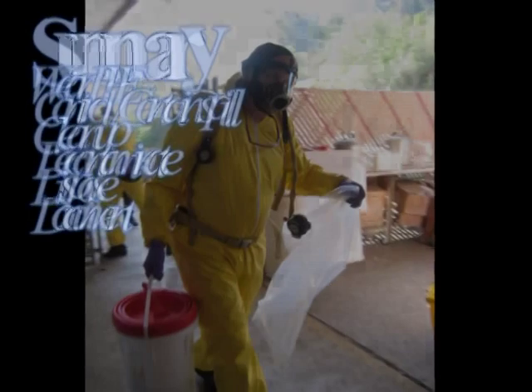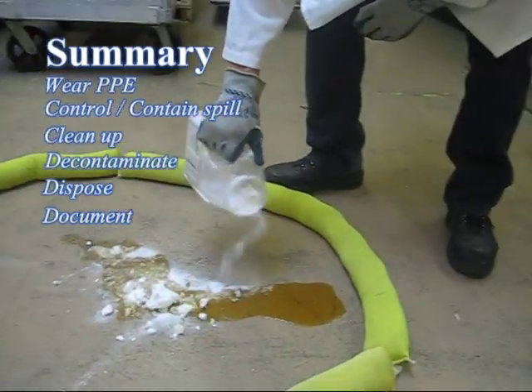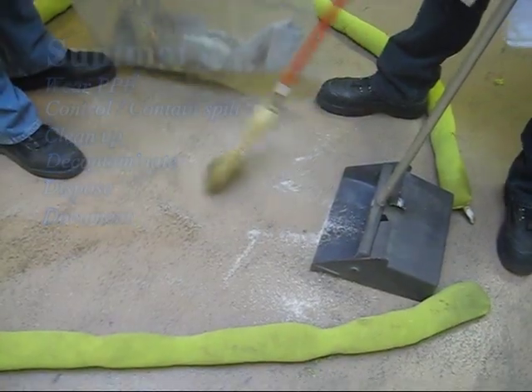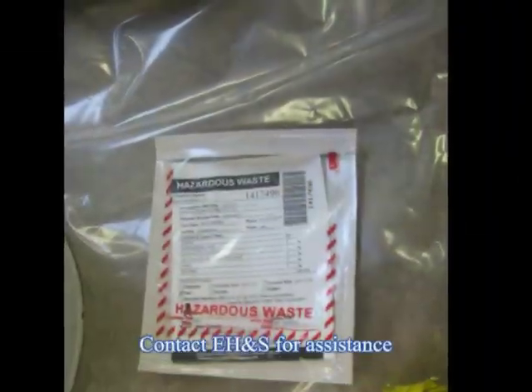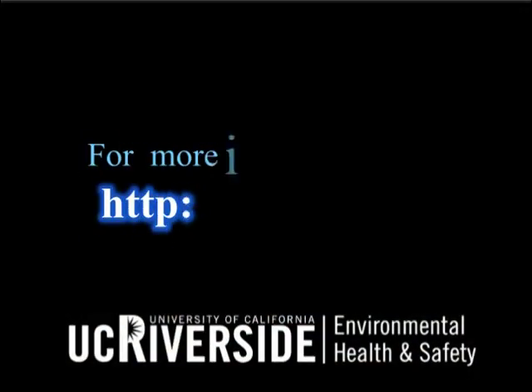As a reminder, remember to wear appropriate PPE, control, contain, and clean up the spill, then decontaminate, dispose, and document appropriately. For more information or if you have questions, please contact Environmental Health and Safety. For more information, visit www.ehs.ucr.edu.